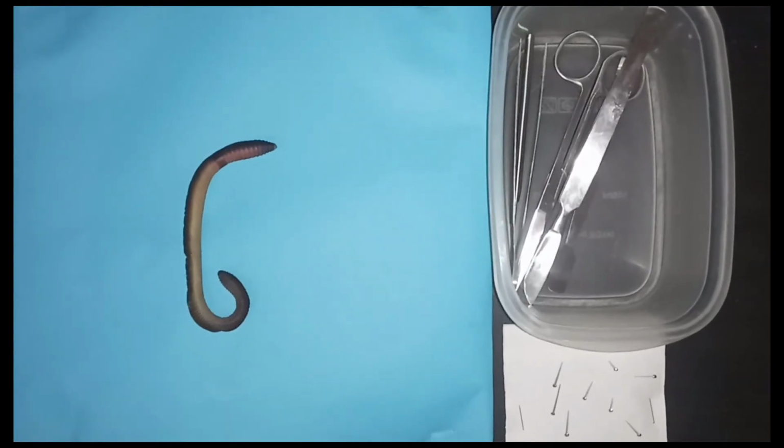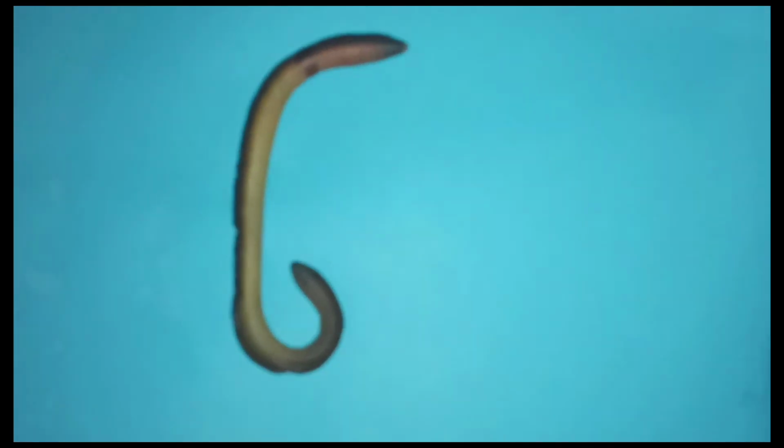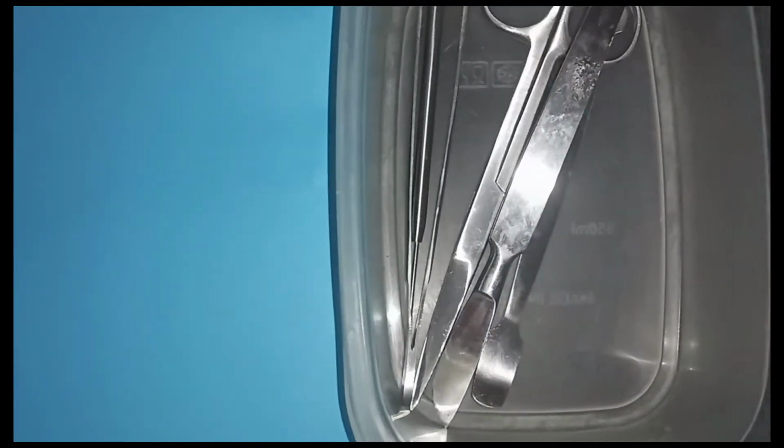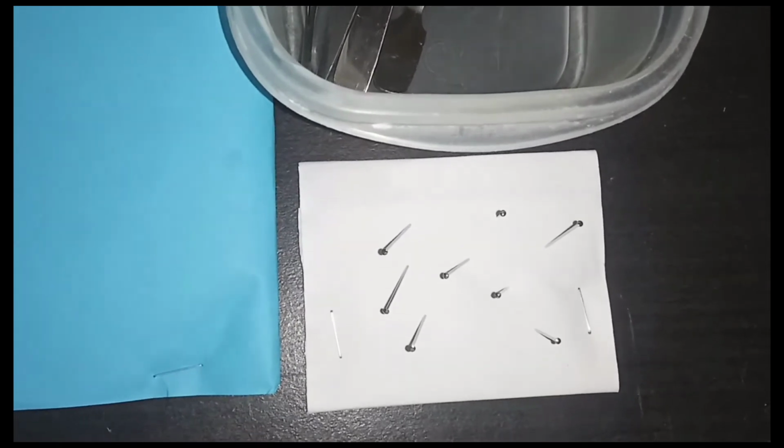For this video, I'm going to dissect an earthworm. Before we start, here are the materials that we're going to use: the specimen, the earthworm, the dissecting kit, and also the pins.